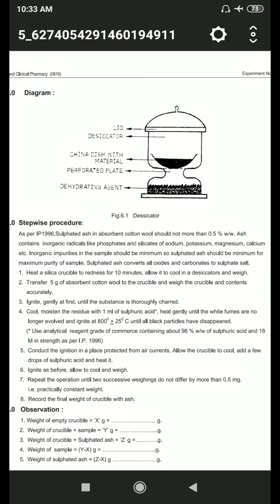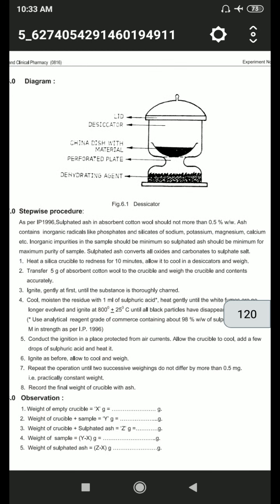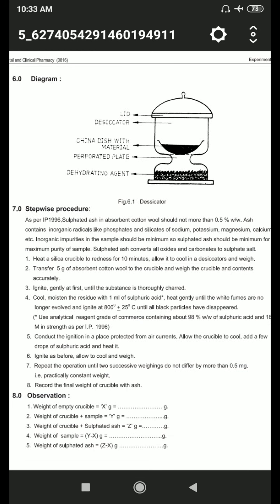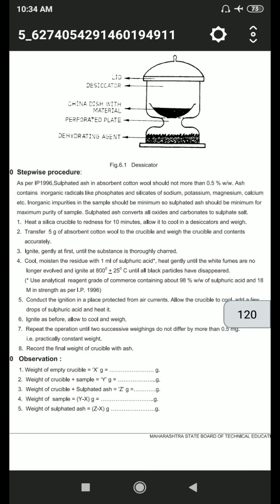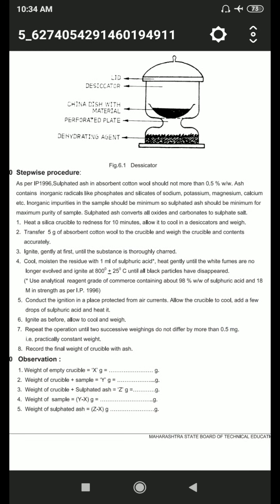First, heat a silica crucible to redness for 10 minutes. Allow it to cool in a desiccator and weigh it. Then transfer 5 grams of absorbent cotton wool to the crucible and weigh the crucible and contents accurately. Then ignite gently at first until the substance is thoroughly charred. Cool and moisten the residue with 1 ml of sulfuric acid. Then heat gently until white fumes are no longer evolved and ignite at 800°C ± 25°C until all black particles have disappeared.